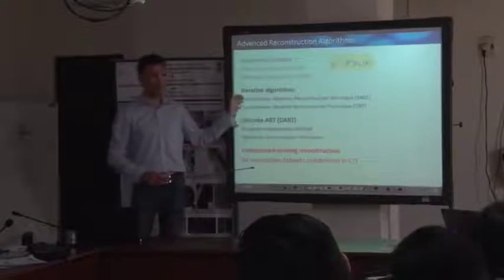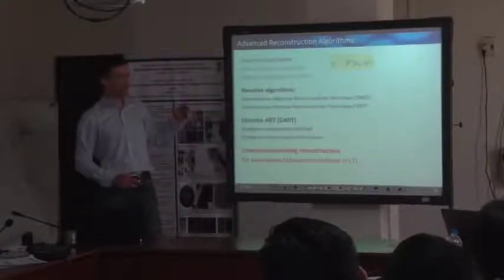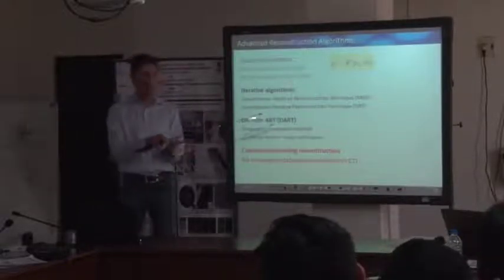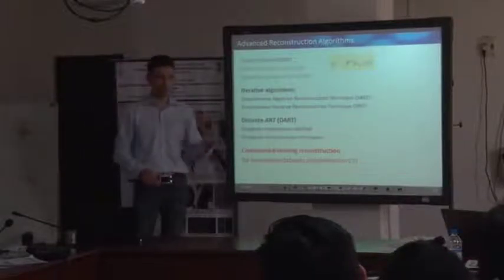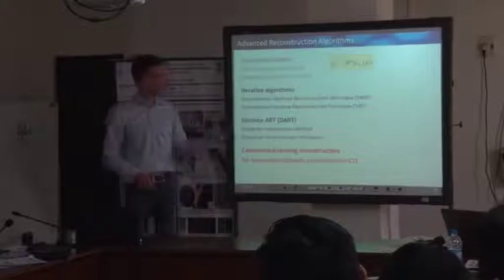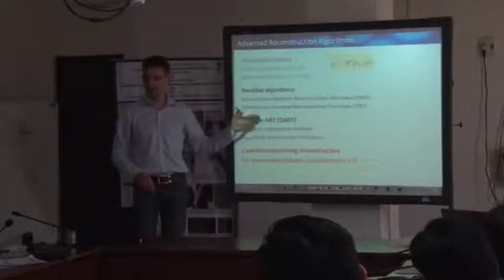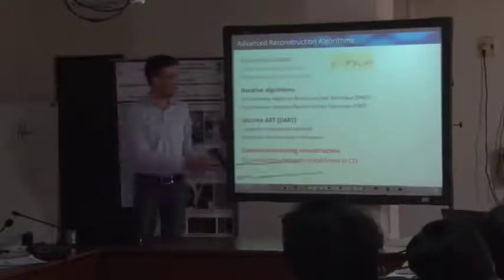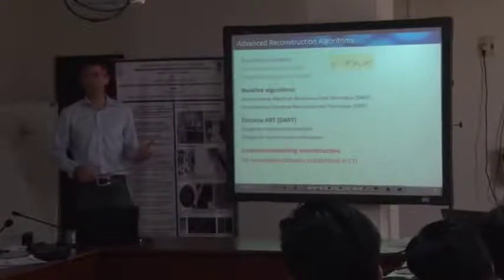You use your projections, you reconstruct the volume, you calculate a set of modeled projections, and then you compare them to the original data, and by that you iteratively enhance your reconstruction. So these iterative reconstruction techniques are also commonly in use. It's called SIRT, and there are free software tools available to do such reconstruction.